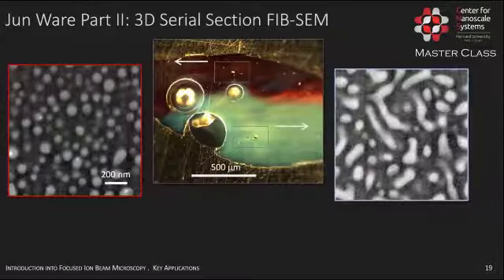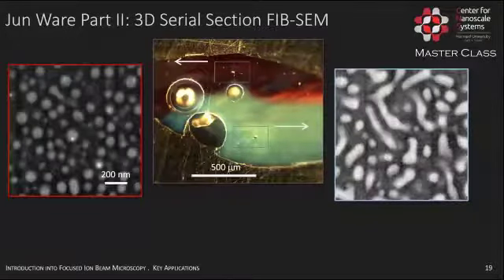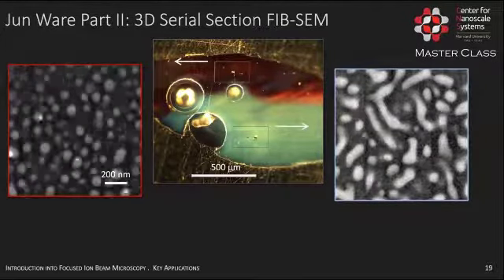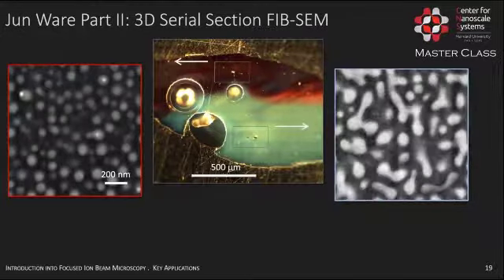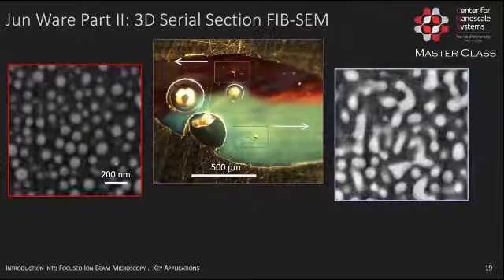this material. So now we can further interrogate the sample with the help of 3D serial sectioning. So here on the left side, you see a sequence of images that we have taken in the red phase, and you can see how we are going step by step through these high contrast globules, and every now and then you see the bright copper particles blink up. When we go down to the blue phase, you see this intricate network of the high contrast phase, and the images that you see here are based on backscatter imaging.